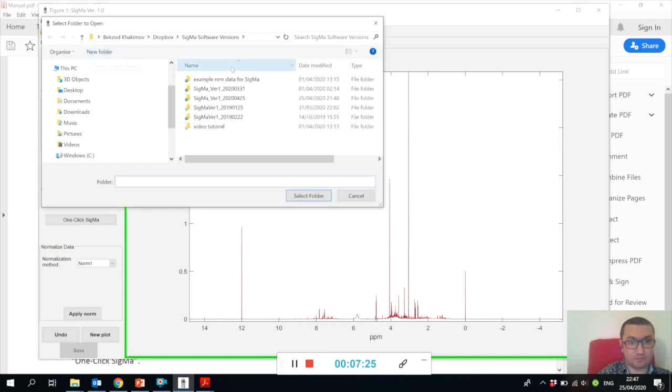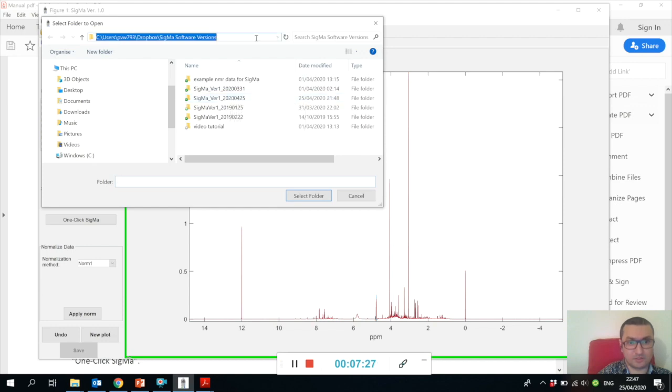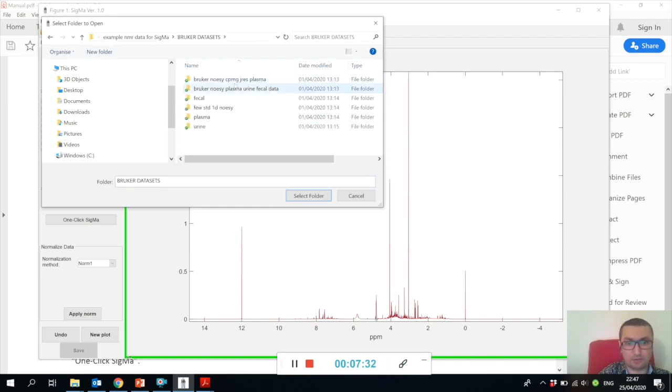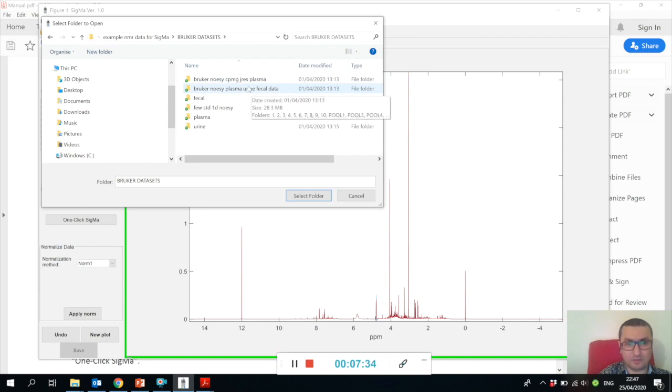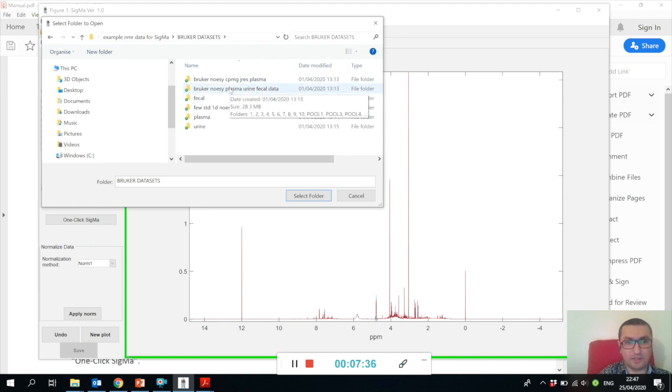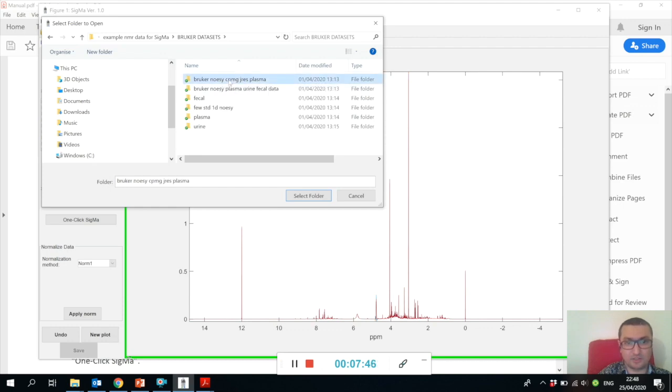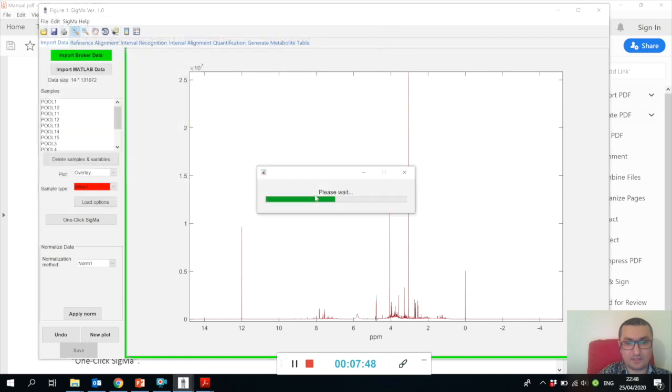Let me show you how Sigma checks your data compatibility when you open the raw Bruker data files. For example, let me try to upload completely incompatible datasets. Let's say we are trying to open Bruker plasma datasets acquired by three different pulse sequences - NOESY, CPMG, and JRES - and let's see what happens.